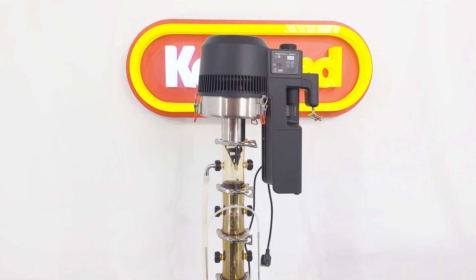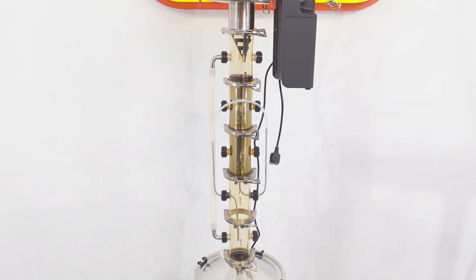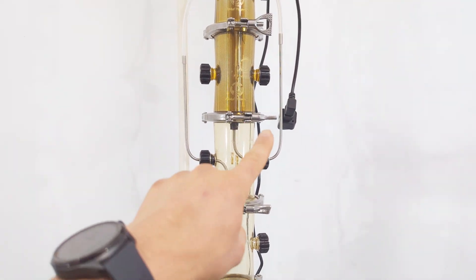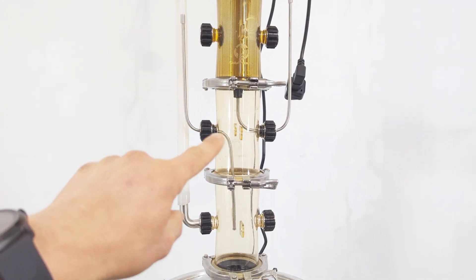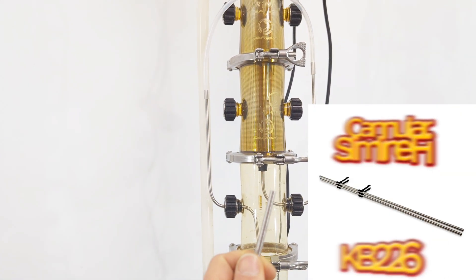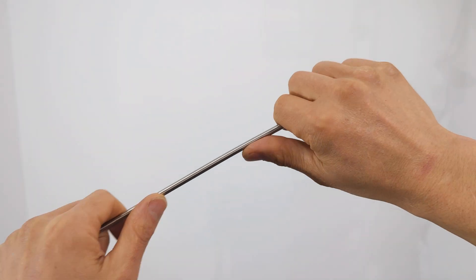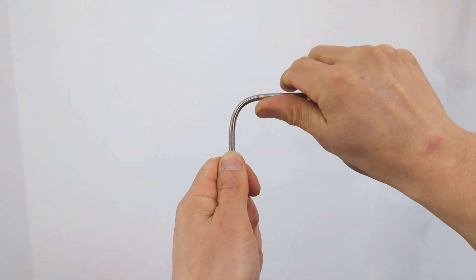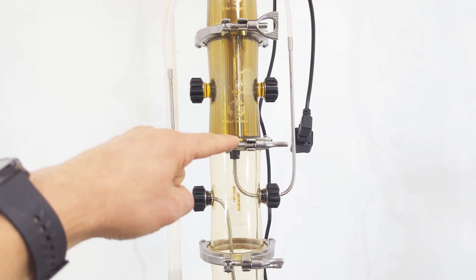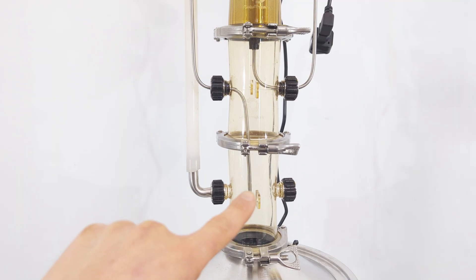For the build of this still it was relatively straightforward, because most of the products are available off the shelf on our website. A couple of them I had to make and modify. Just under here you can see two stainless steel pieces — these tubes are stainless steel tubes available on our website. These are actually the upgrade tubes for our cannula canning machine, sold as a pair. This diameter is quite easy to bend by hand. I've made one tube that ends and goes down in a simple shape, and another tube bent in a Z-shape.